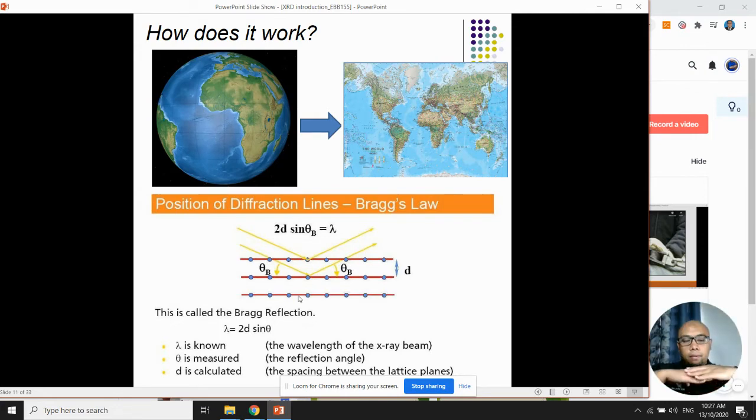Okay, let's say you have one piece of paper. On top of the paper, you put some circles representing the atoms of the material. Then, in order to get a crystalline or solid material, you need to form many layers of planes like this. Say you have a solid material with 100 layers of planes containing many atoms. Between these planes, we call the distance the interplanar spacing.